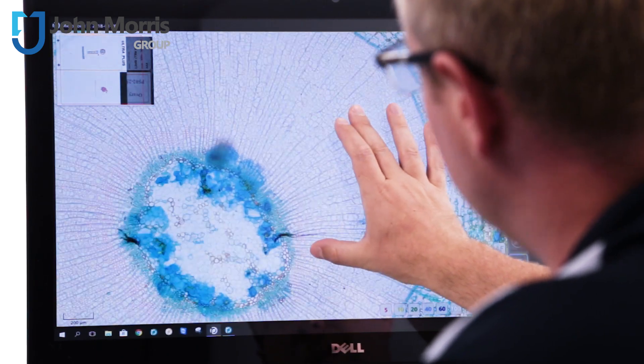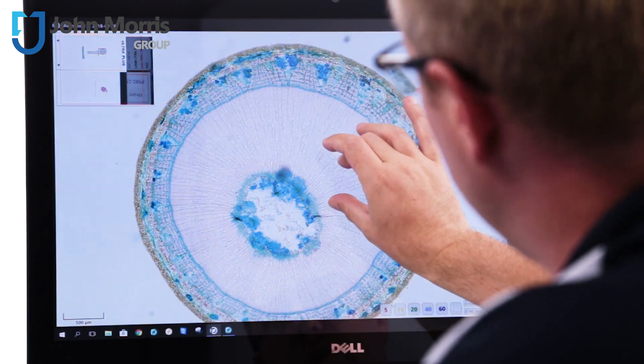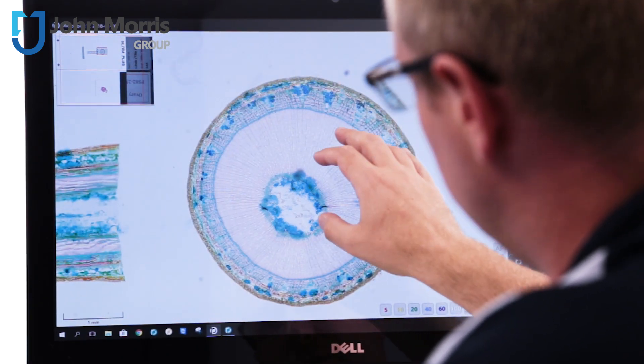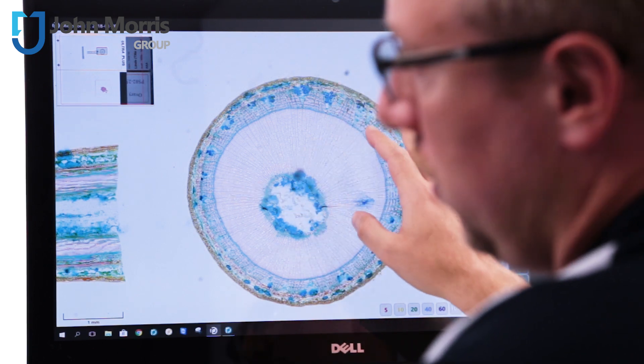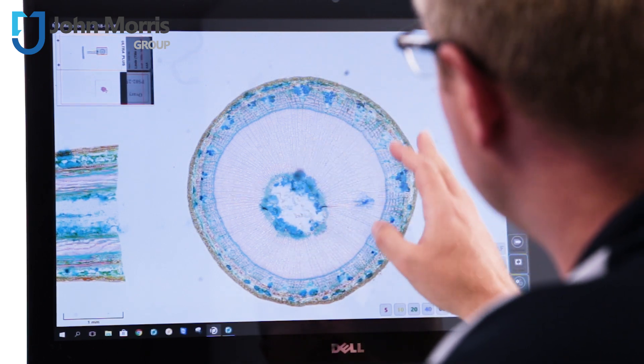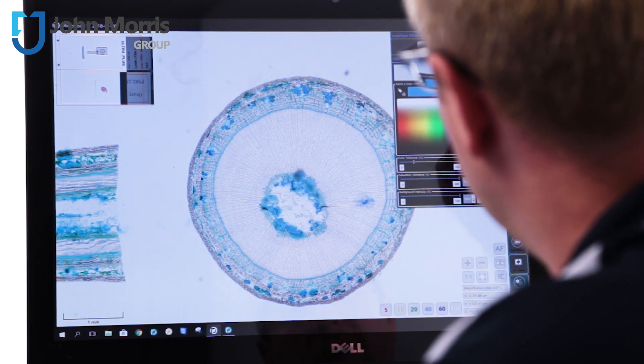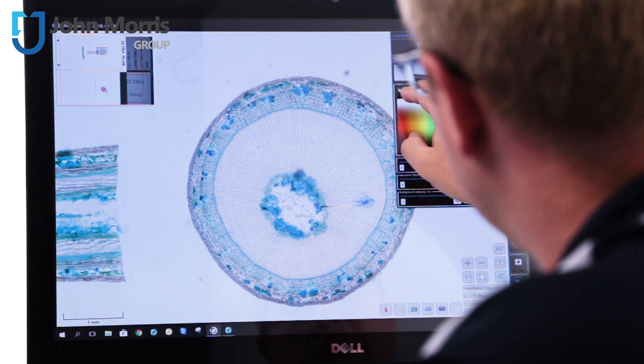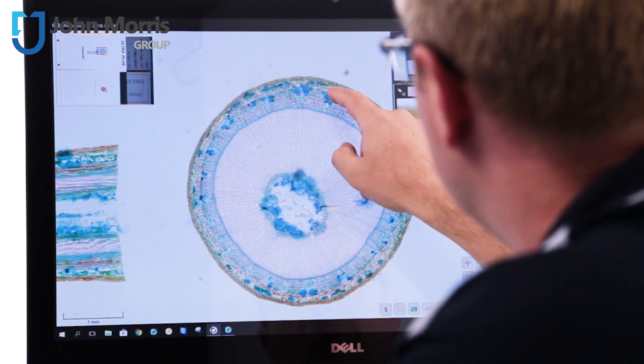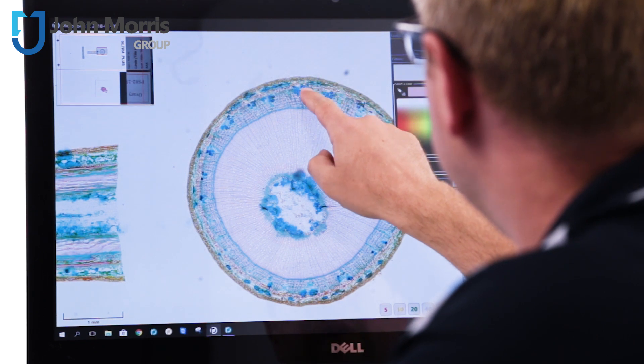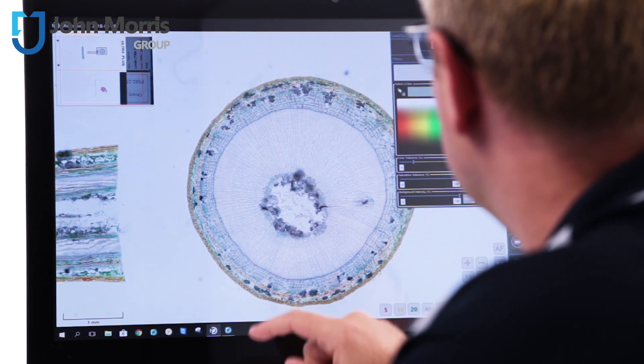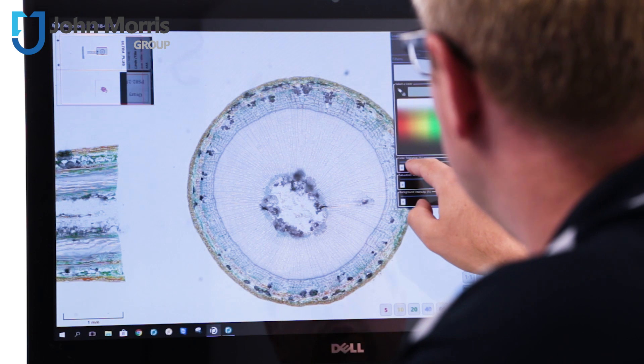One of the other really handy features about the software is the ability to apply filters that can help you to determine areas of irregularity or areas of focus. So let's have a bit of a look at that and what we're going to do here is we're going to have a color extractor filter and we're going to say well we're going to take this pipette here we will pick a blue color and then what we can do is we can actually remove all the other colors.